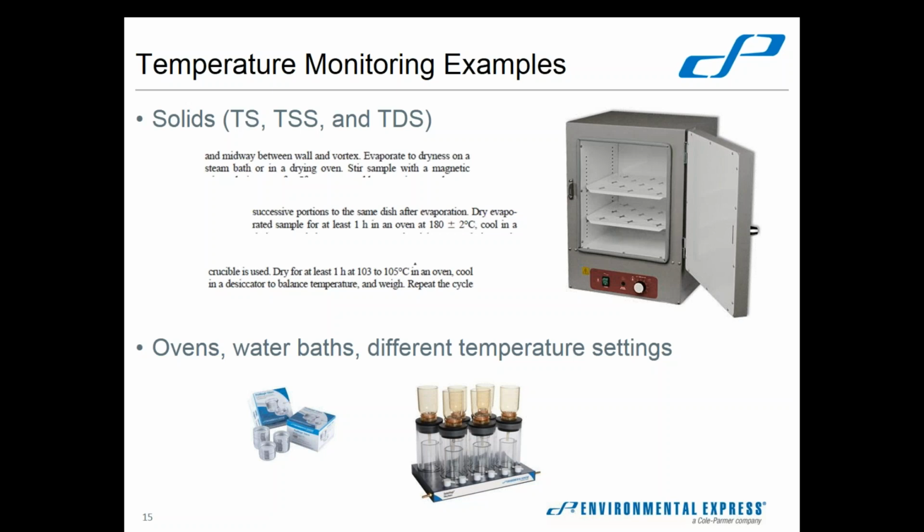But yeah, so you can evaporate the sample however you wish. There's no specific temperature requirement for doing that. The actual temperature requirement only comes into play for total solids. It does tell you, once it's evaporated, to put it at 104 plus or minus 1, and then 180 for TDS, and then again 103 to 105. Why they don't say 104 plus or minus 1 there, I don't know, but consistency's sake.